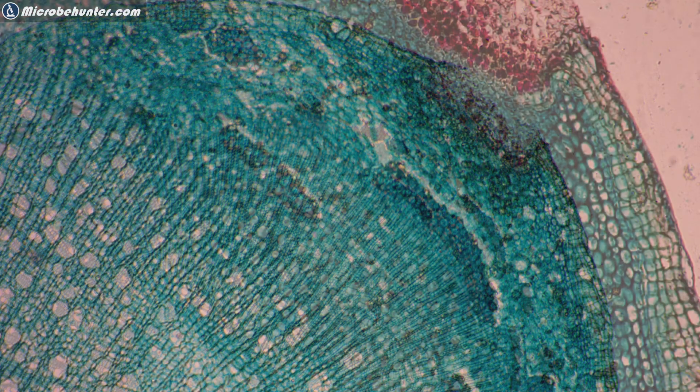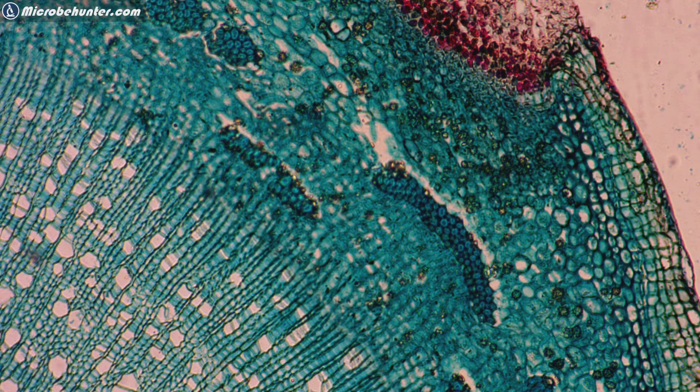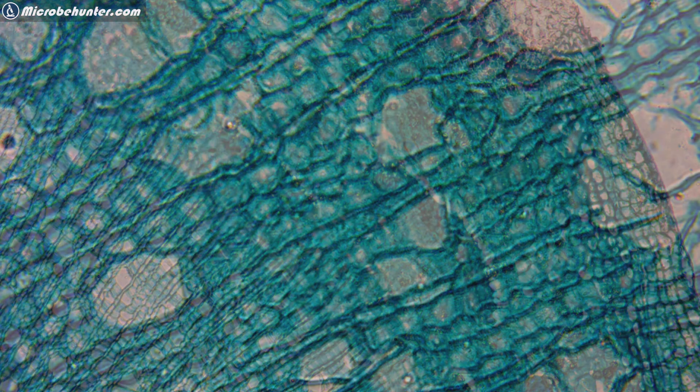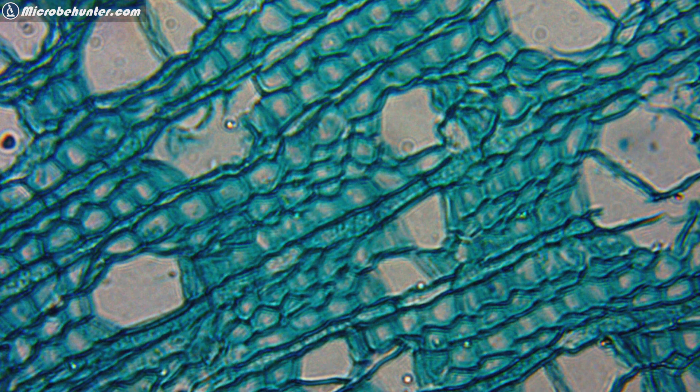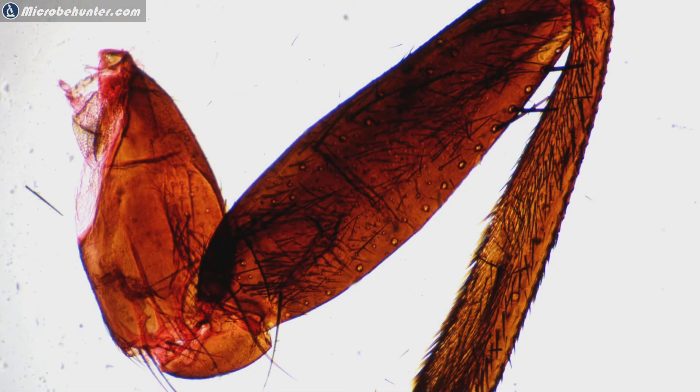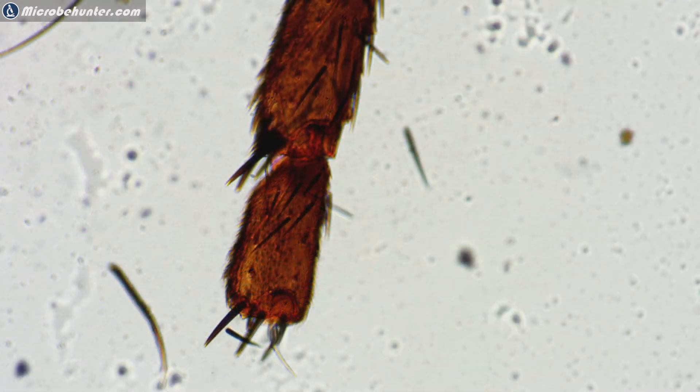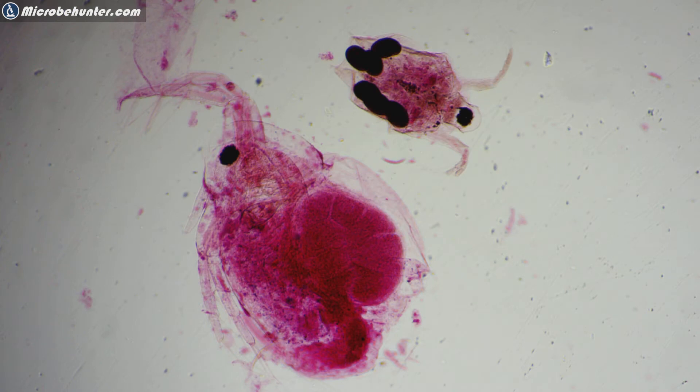At a higher magnification. Again there is no condenser here to adjust contrast in depth of field so you can see a little bit how the quality is like and it's quite nice. The leg of a fly again it's the permanent mount that I showed you before, here at a higher magnification, the tip part of a fly leg. These are some water fleas.